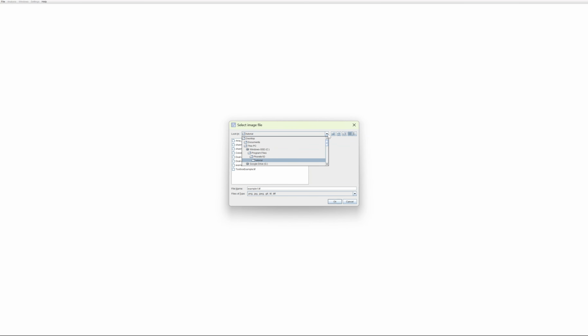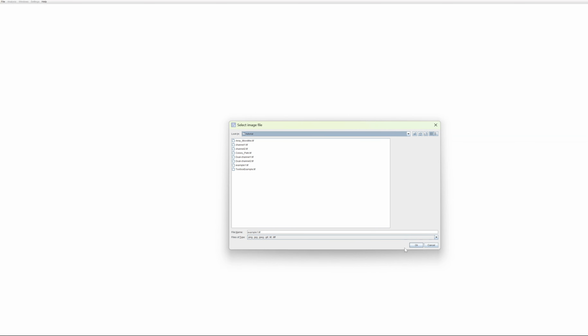This file browser is quite difficult to use. It's quite antiquated. It's very ImageJ-esque. It's very of the time. It's not kind of standard. It's very small to see your files. I can expand it here, but the text is very small.